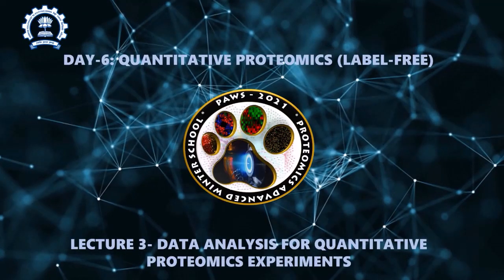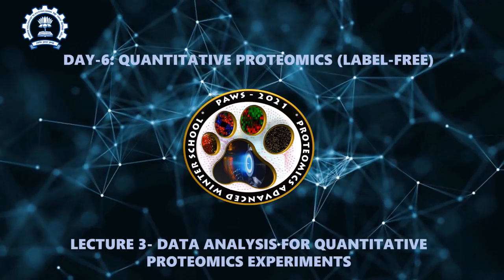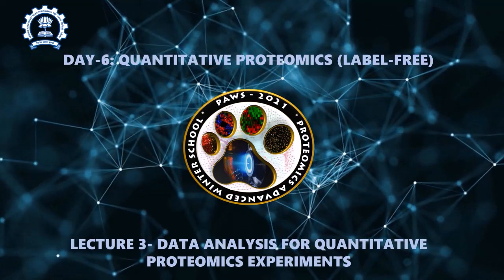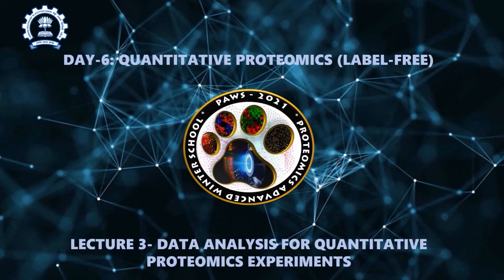Day 6, Quantitative Proteomics, Label Free. Lecture 3, Data Analysis for Quantitative Proteomics Experiments.